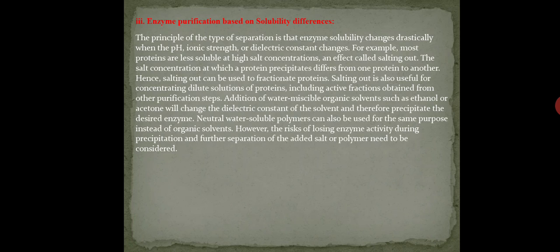This method, salting in and salting out, is used in the determination of precipitation of protein.